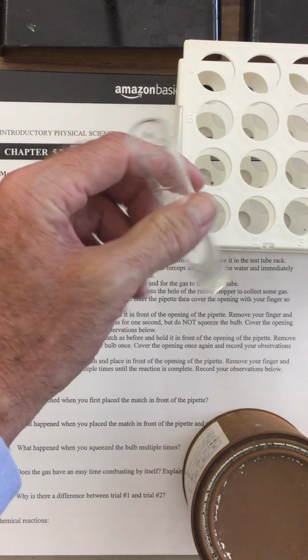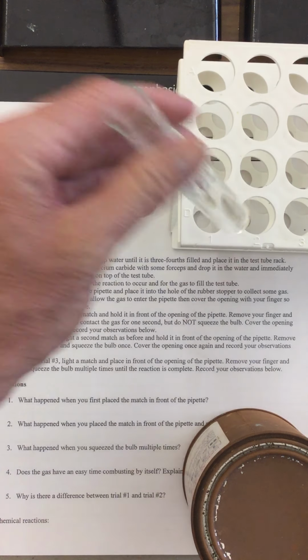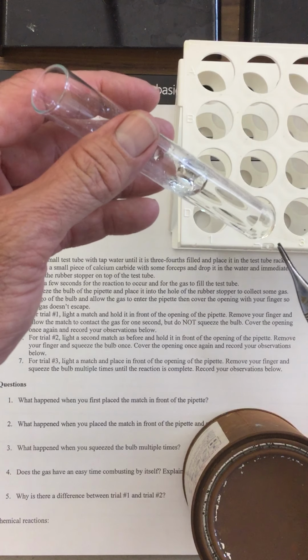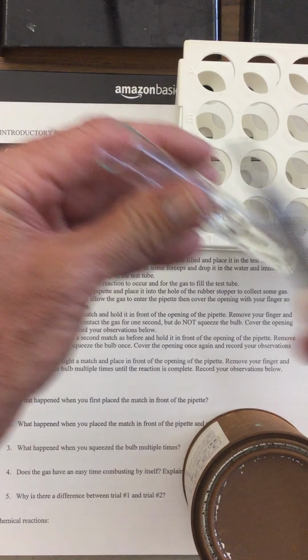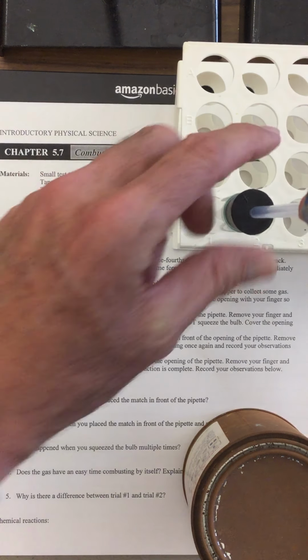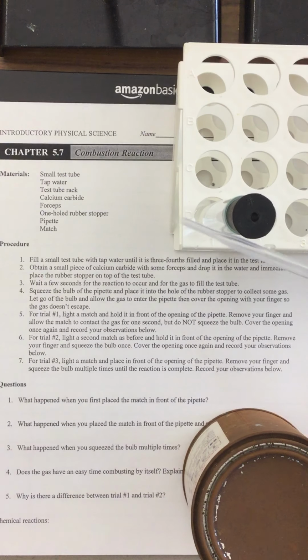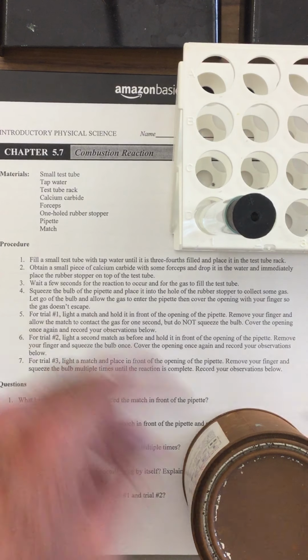So currently right now in the test tube is just water and air. And what's going to happen is the rock's going to fall down to the bottom, the calcium carbide, and it's going to be producing gases. The gases are then going to push the air out, and this is going to be filled then with an explosive gas. We're going to put this rubber stopper on top like that, and then I'm going to squeeze the pipette, insert it into the rubber stopper, and then extract a sample of the gas. And we're going to do 3 trials, trial 1, trial 2, and trial 3.